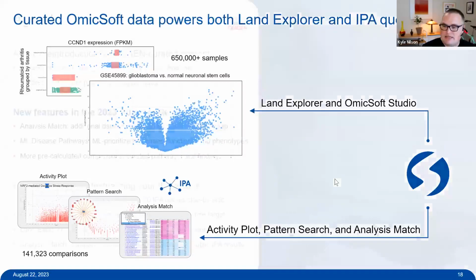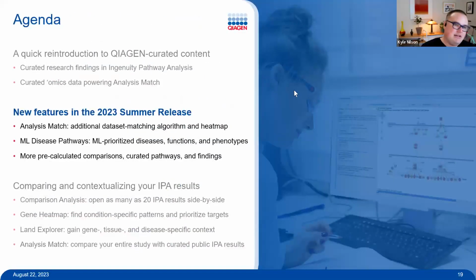So ultimately, we have a variety of curated data that we've been collecting over the past 20, 25 years, both from OmicsSoft as well as from Ingenuity.